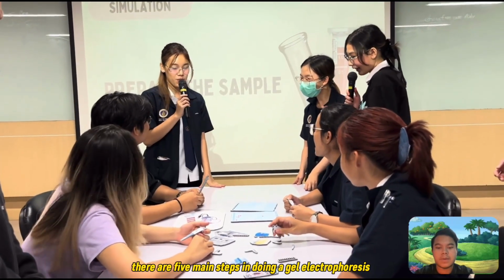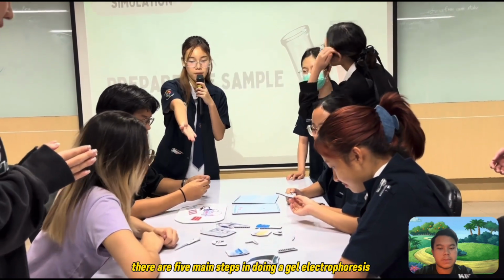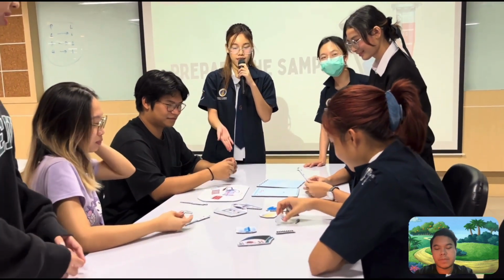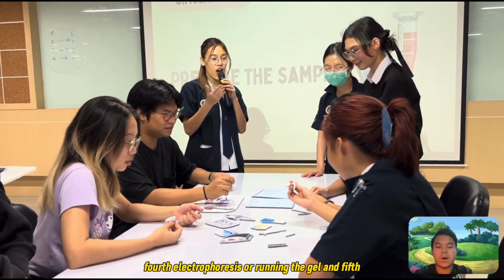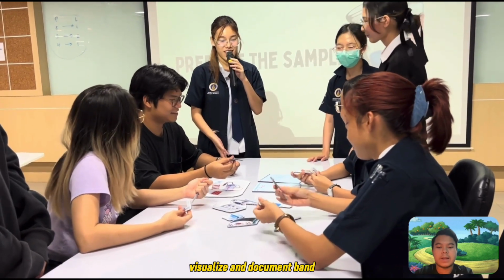There are 5 main steps in doing gel electrophoresis. First, prepare the sample. Second, prepare the gel and buffer. Third, load the sample. Fourth, electrophoresis or running the gel. And fifth, visualize and document the bands.